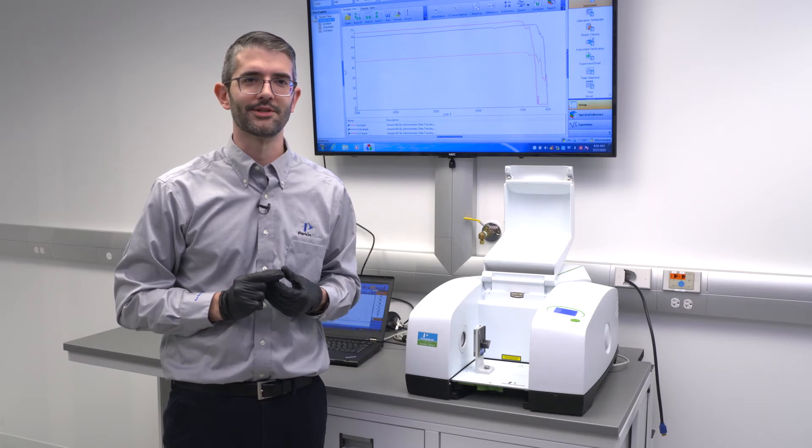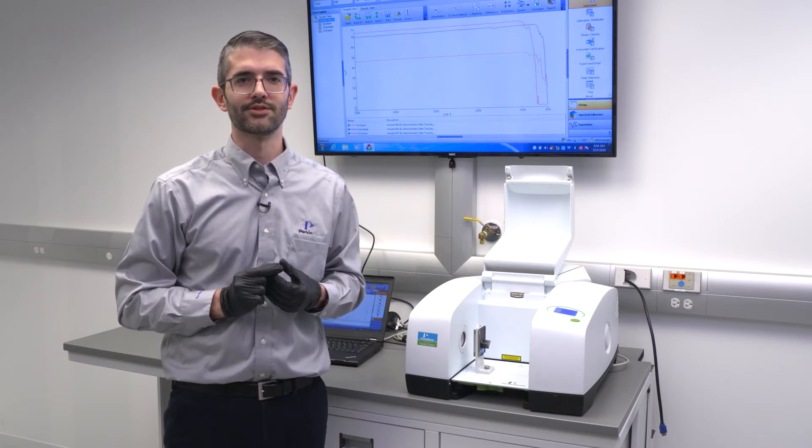Now the measurement process, as with any other FTIR, proceeds in a two-step fashion. The first step being a background measurement, the second step being sample measurement.